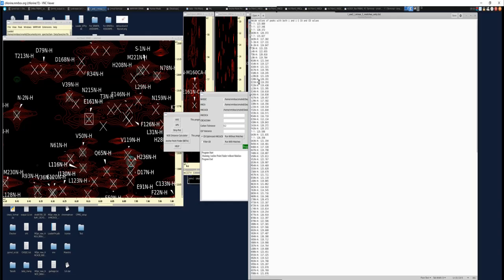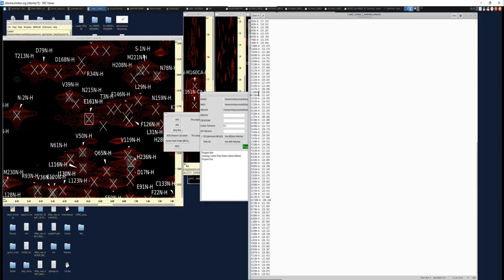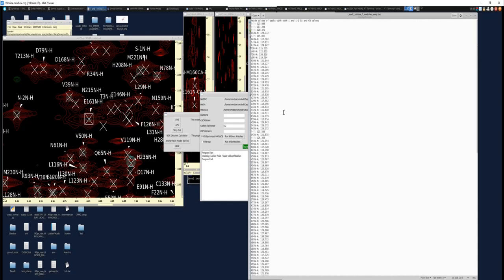So these would all be good anchor points because they both have I and I minus 1 C alphas, right? So you can easily use a strip plot for these. And if you can find even the I minus 1 or I plus 1 of any of these, because you have C alpha C betas, that's enough with Sparta to assign them. So that's one useful way to use it.